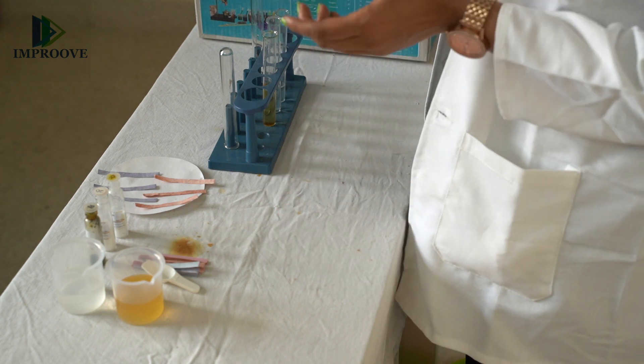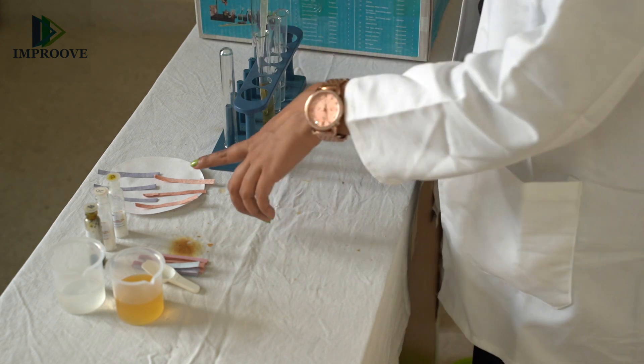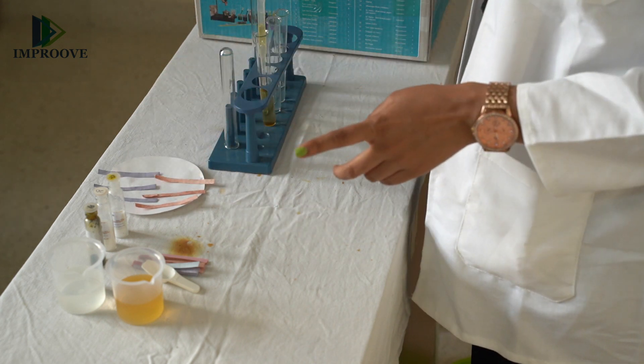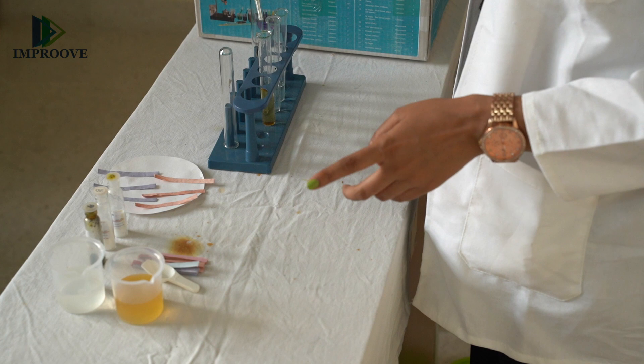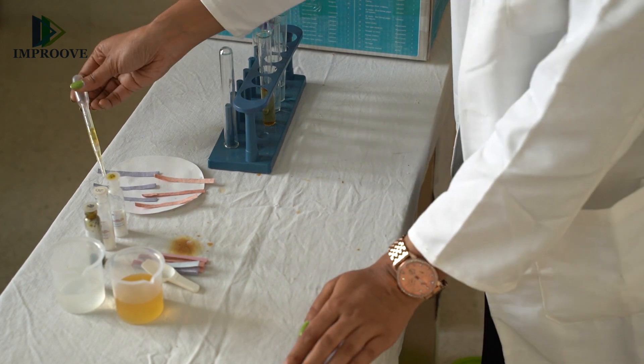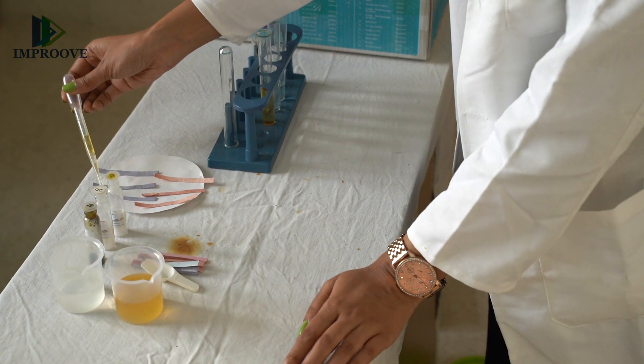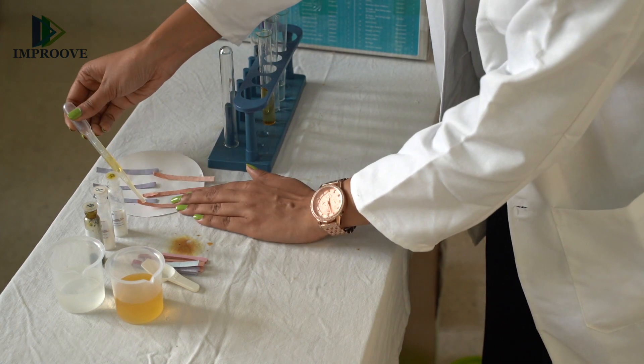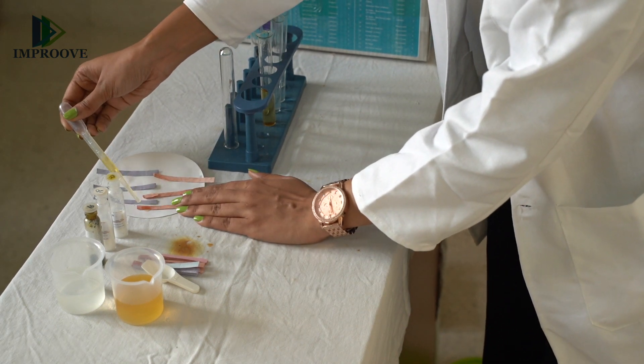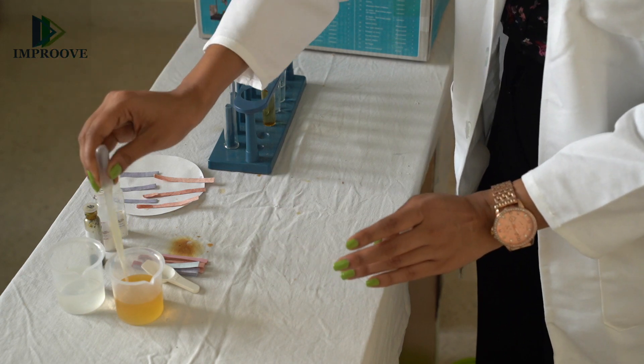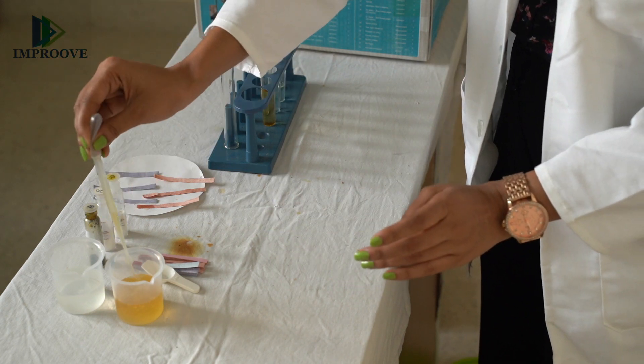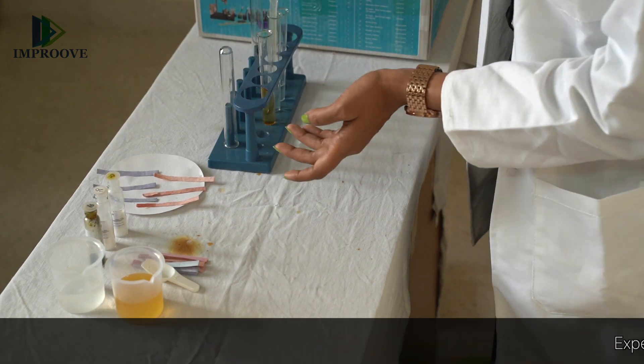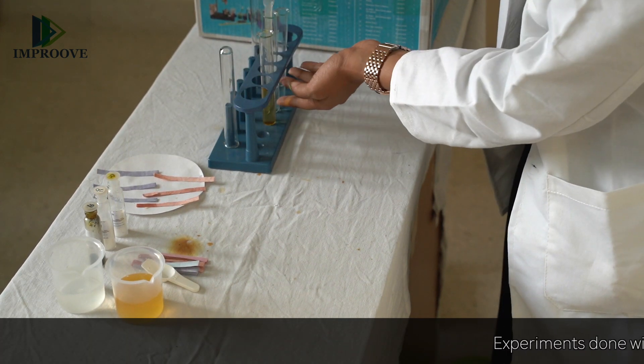Now we will take our dropper, and with the red and blue litmus papers here, we will drop about 1 or 2 drops of the ferric chloride solution on both the blue and red litmus paper. We will repeat this with the other two salt solutions and observe the color change on the litmus paper.